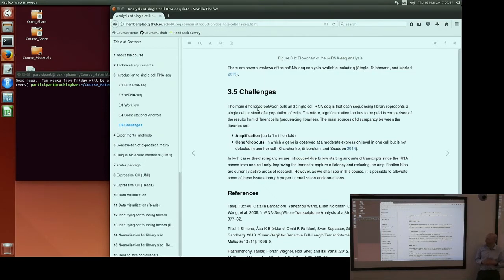That's what's referred to as a dropout. It causes all kinds of bother, including on the pure algebraic level, because having zeros often makes life a lot more complicated, particularly if you want to try to divide by them.